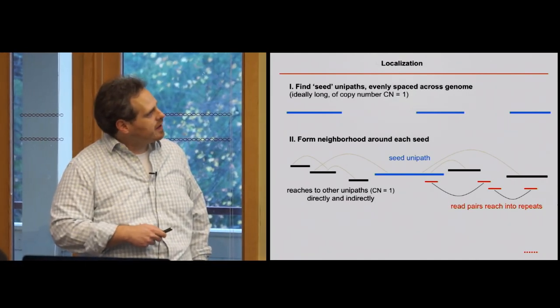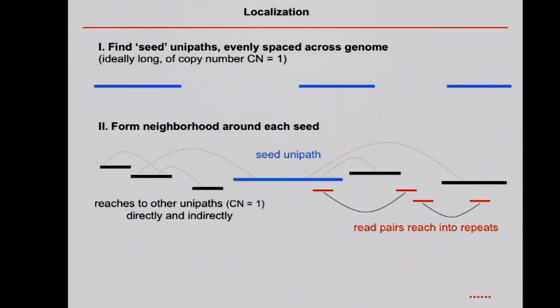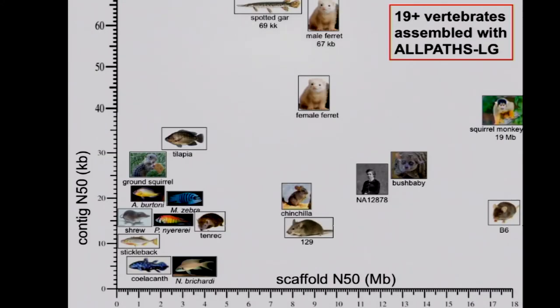Notice here there can be some interesting things happen where we're going to have this one contig, and we're going to have gaps from one contig to the next. If you've ever looked at the reference human genome, where you see NNNNNNNNNN, this is where the assembler knows from mate pairs these two sequences should be next to each other, but there are complicated repeats or gaps in coverage where we don't know the actual base pairs, so we just put in Ns to space things out appropriately. And then we do this many times, use other sequences to patch in some of those gaps, and hopefully build out bigger contigs and nice scaffolds.